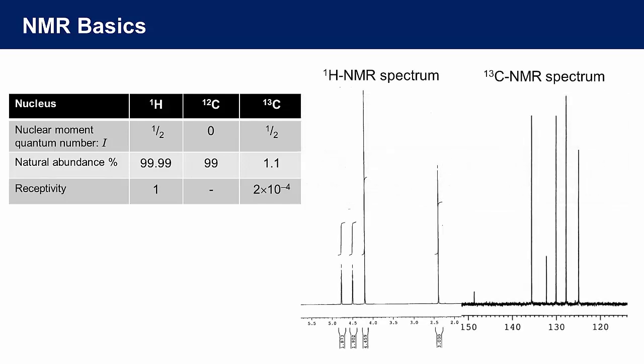I want to show you how this plays out in a couple of comparable examples. The first spectrum is a proton spectrum, or a 1H NMR spectrum. It took about 7 minutes to collect. It has a high signal-to-noise ratio, and from the measurement we get peak positions of the peaks, and we can integrate peak areas and get some idea of the number of different types of proton contributing to each peak.